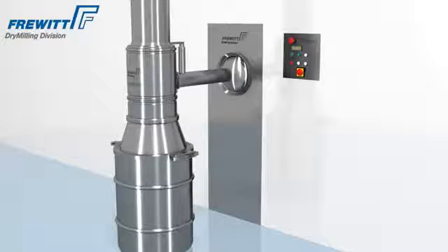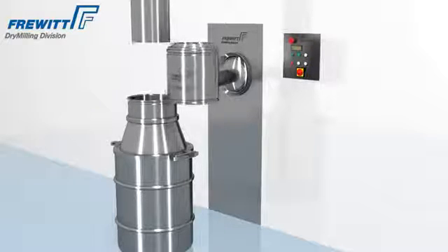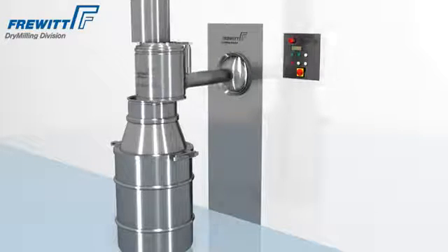The newly developed ball joint for inline production helps to change the production with the required mill and sieve modification within minutes.